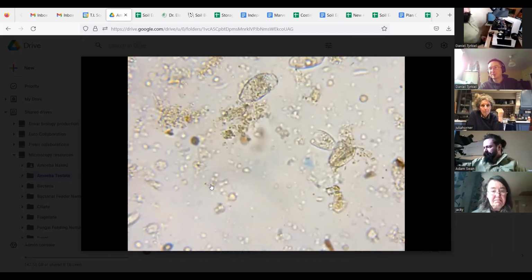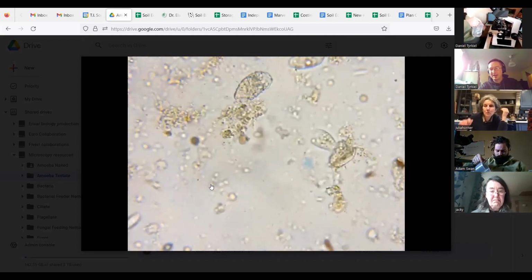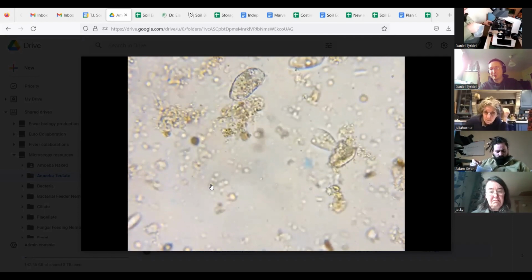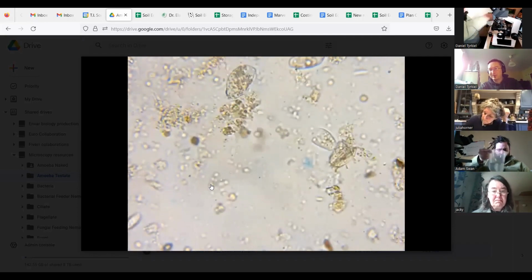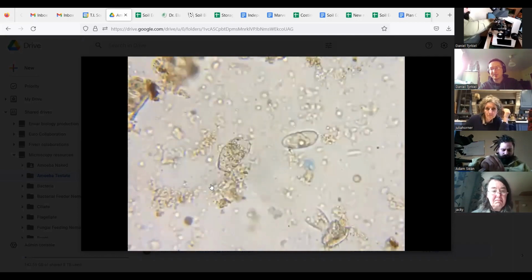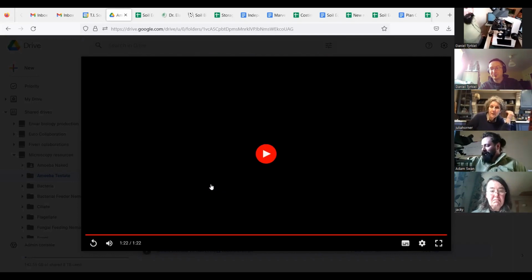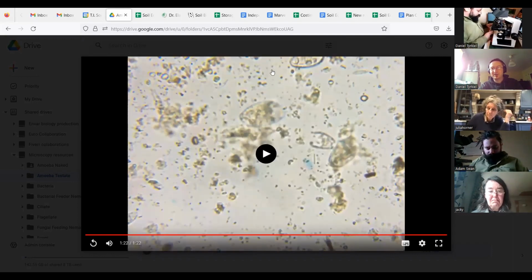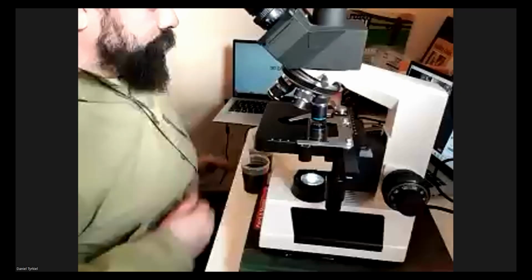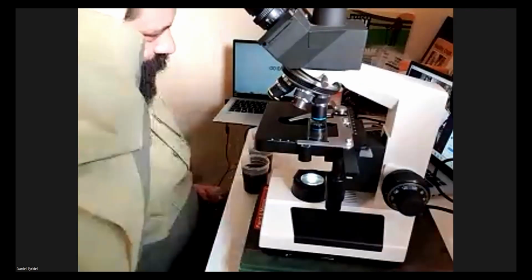The thing that you want to spend some money on is the microscope. And I can tell you now that if you show me a microscope called Swift for £200, I will cry. Do not buy it. It's something that I spent a day on, and I do not want to spend another day on that microscope. It's not accurate, and it's very dark. Its light is very dark.